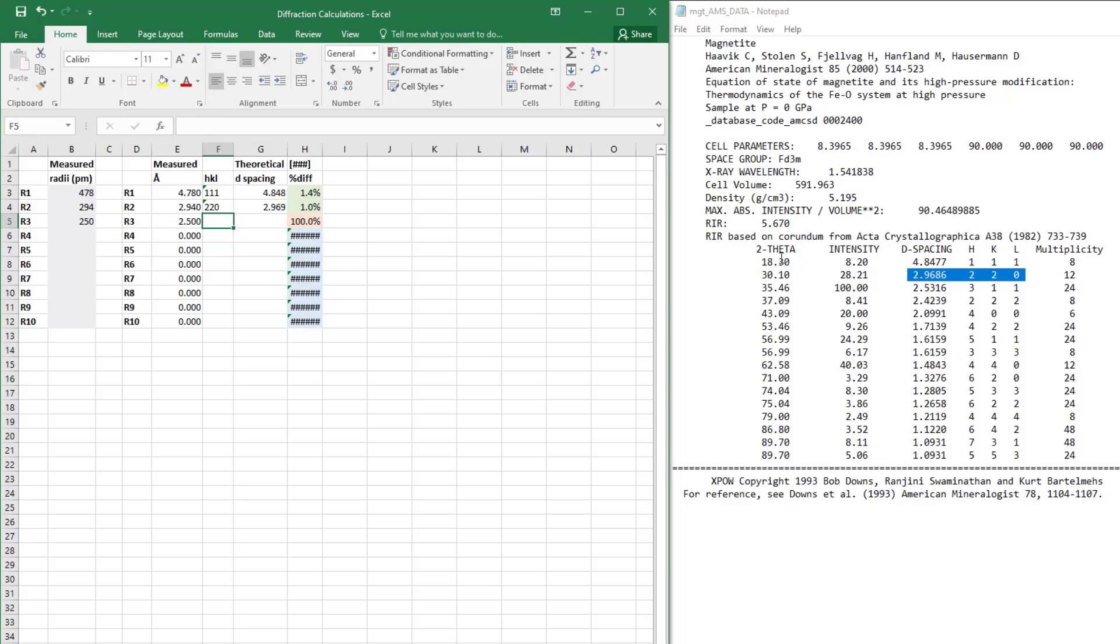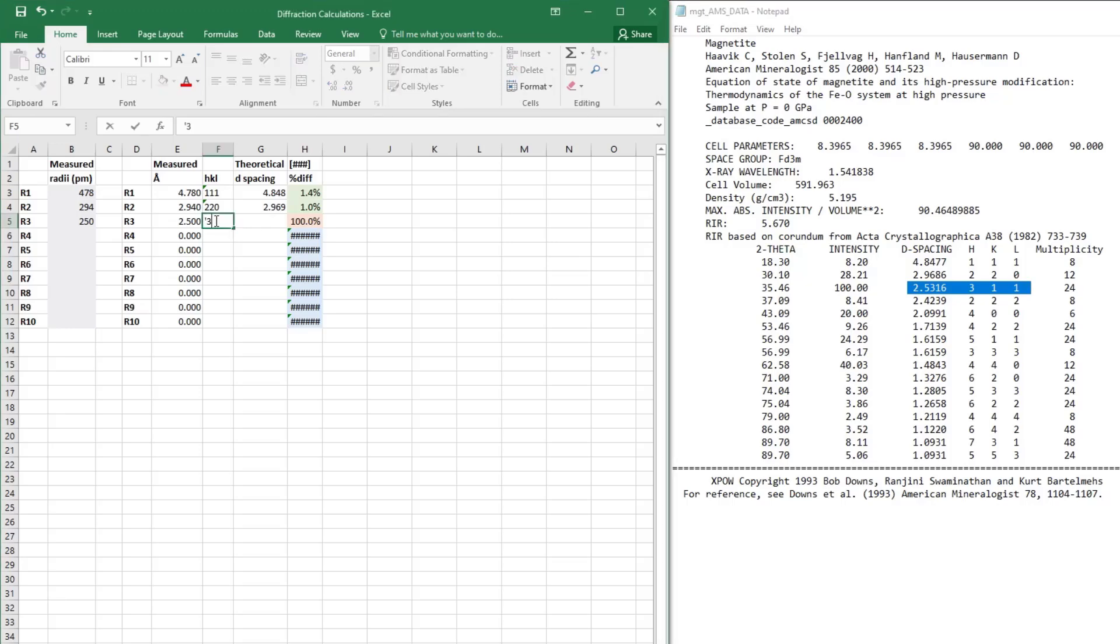Then we have our last ring, and the best match is to the 311 plane. So let's go ahead and type in those values just so we have them in our notes, and we'll see what the percent differences are.